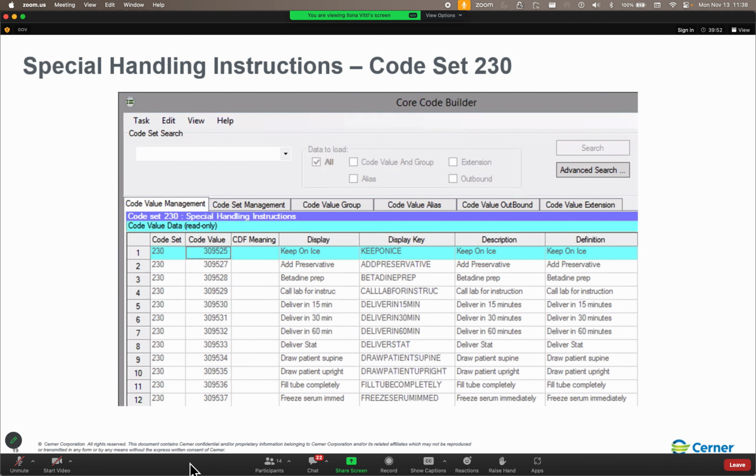So folks, we're going to wrap up this part by talking about accession netting. How do orders get the same accession number? Well, with accession netting, there's only 4 parameters involved. The orders have to have the same accession class. And, as you saw, if they have the same accession class, they're going to have the same accession format, no problem. The orders must also have the same requested start date and time. So for us, that means they need to have the same collection date and time. And they have to have the same conversation ID with the netting server.